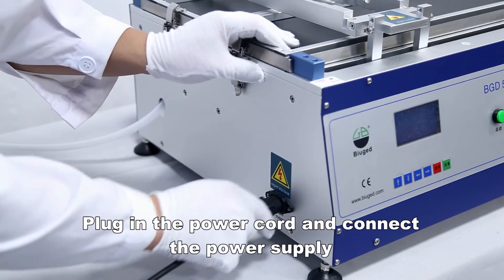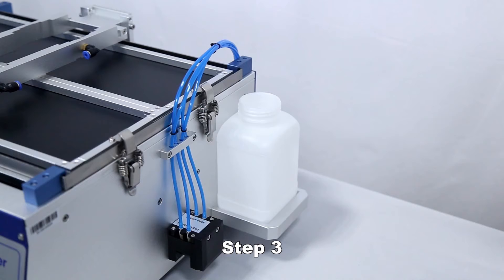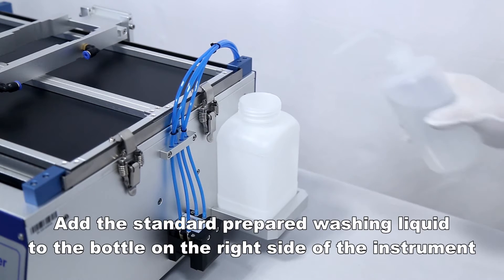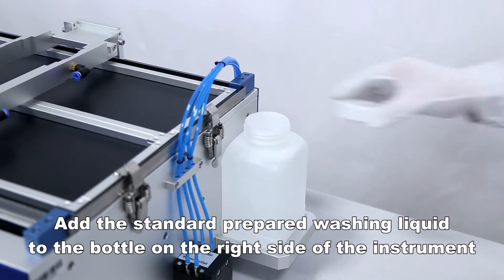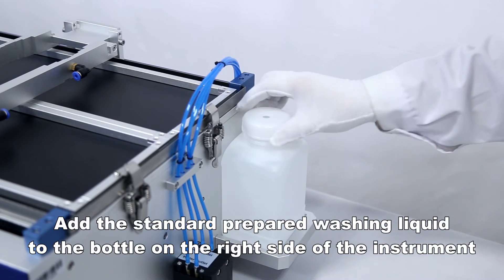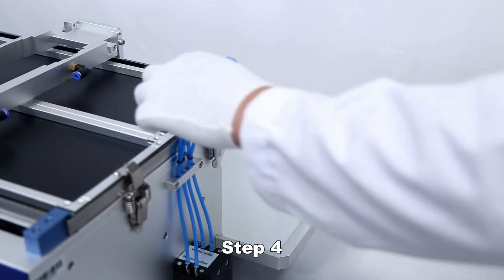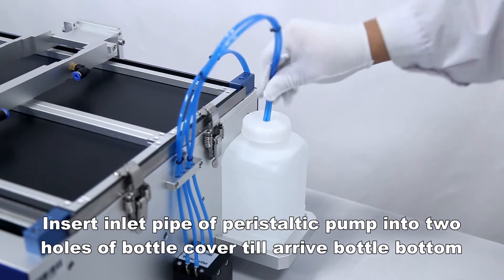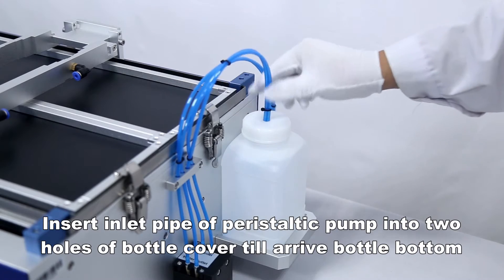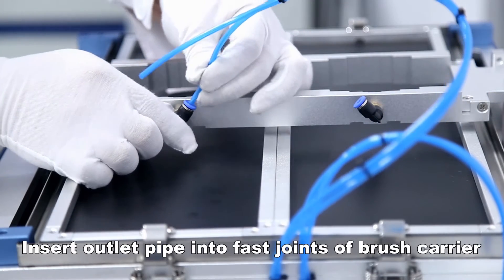Plug in the power cord and connect the power supply. Add the standard prepared washing liquid to the bottle on the right side of the instrument. Insert the inlet pipe of the peristaltic pump into the two holes of the bottle cover until it reaches the bottle bottom, then insert the outlet pipe into the fast joints of the brush carrier.